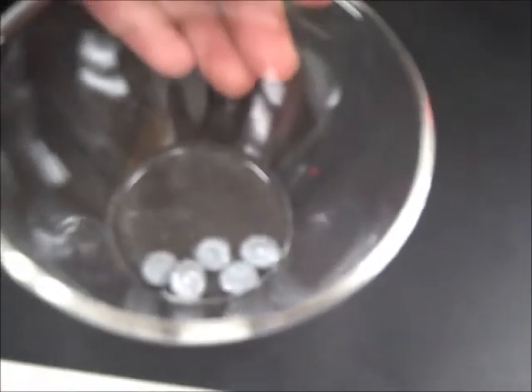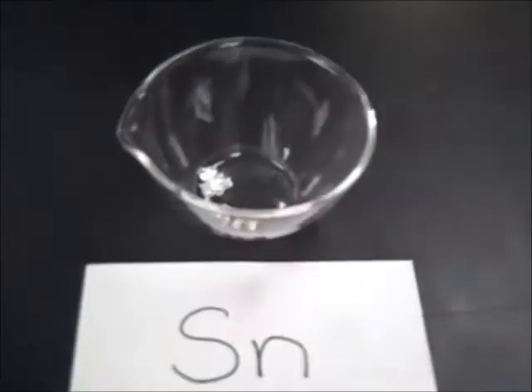There's a little bit of bubbling. It's a little bit of fumes or smoke. You can see it bubbling on the outside. Not as fast or as exciting as magnesium, but it is reacting. The zinc is reacting. All right, go for that tin.